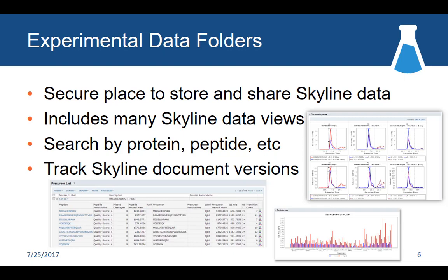We do have full support for Skyline small molecule capabilities. I don't know if that's been discussed yet on the course, but that's something that Skyline added a couple of years ago, and then we played a little bit of catch-up on the Panorama side to make sure that all that data that Skyline is generating, we're able to import and then expose and mine down the road. Like I said, you can search by protein and peptide, and I'll flip the second half to do a little hands-on, and there'll be more sessions with this so you can see what it looks like in the web browser itself.